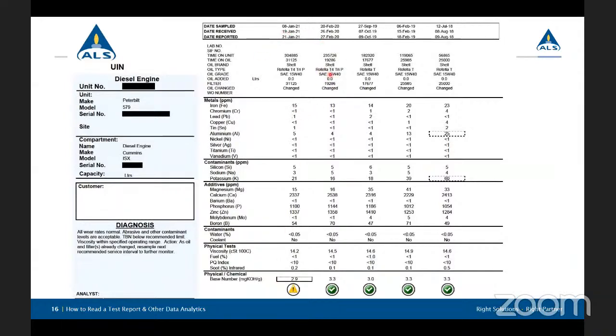They've learned a lot from this oil interval, and perhaps for this unit, truck and engine, this is a really good interval. Now, it's important that they continue to do oil analysis because things can change: the environment that truck works in, or if they change to a different fluid, they're going to need to continue testing. But I always find it interesting to share my point of view that sometimes this can be a positive report, although it's not normal.